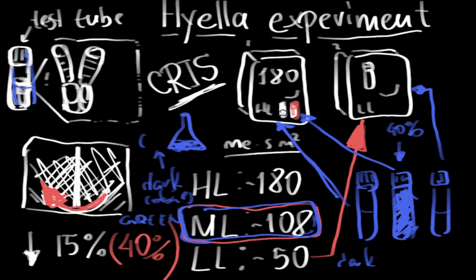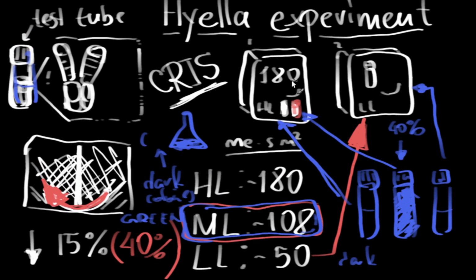So I hope it was not a very long and not a very crowded video about how to set up the experiment of Hyella, and the treatment was the different light intensities.